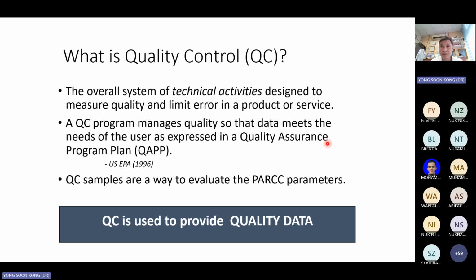So you're still in the planning stage. The document from that planning stage is the sampling and analysis plan. The plan itself is the result of the QA, quality assurance. So QA and QC team, what you're doing right now is at the QA stage, you're planning.